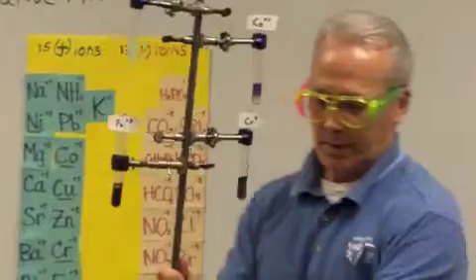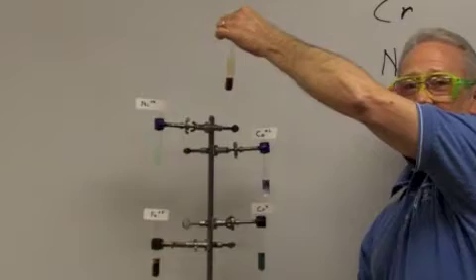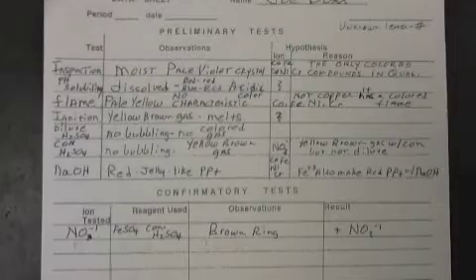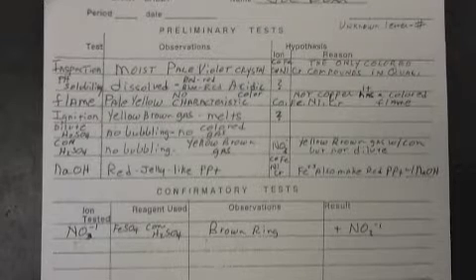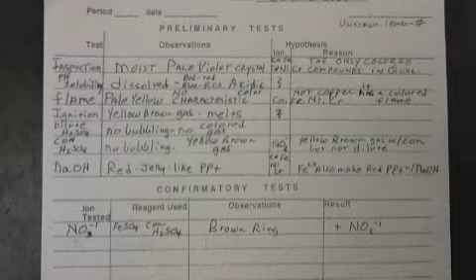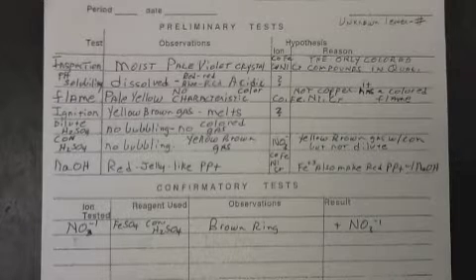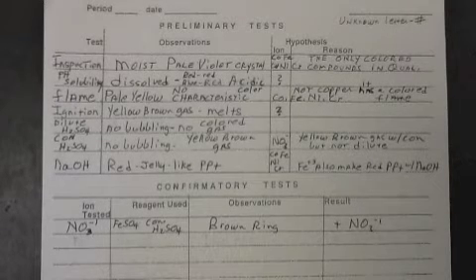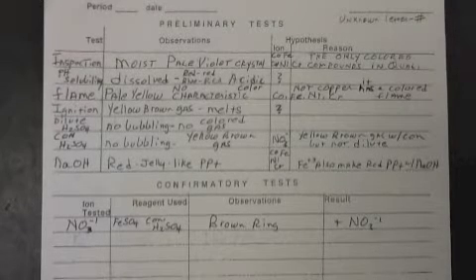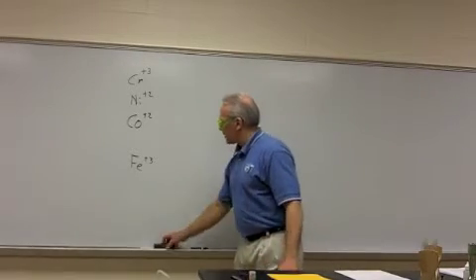Okay, so here's our unknown. Here are the 3 of the 4. Which one do you think matches? I'll give you a moment to jot this down on your data table. What we've done so far is narrow down, we think we have iron.